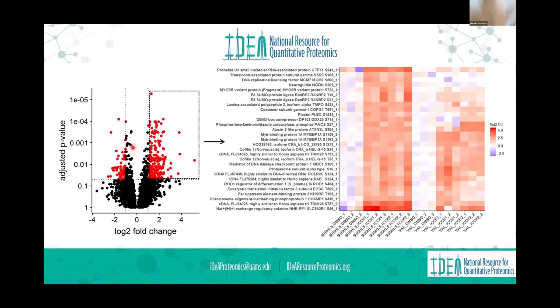One of the things that we can do in the analysis when we do phosphopeptides, it's a little different. The output looks similar to the output Dennis was showing earlier for the proteins, but we do it at the peptide level. And so we're looking at the individual sites. And so we can look now at specific peptides.